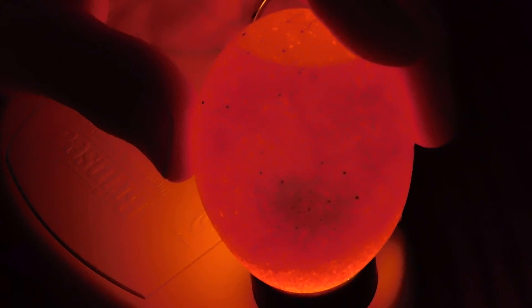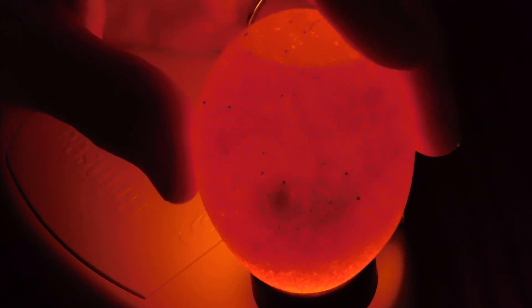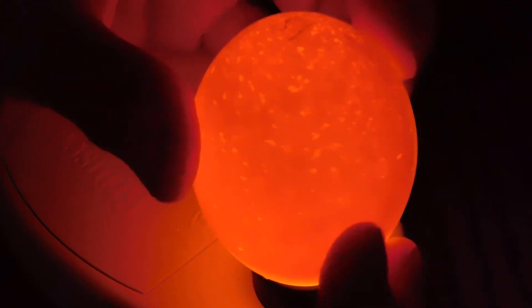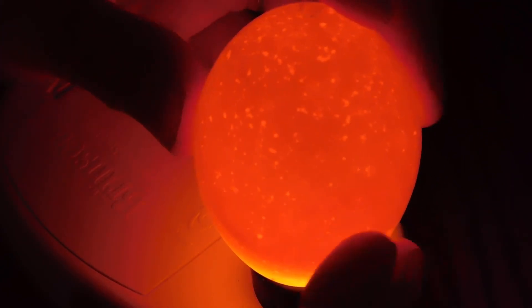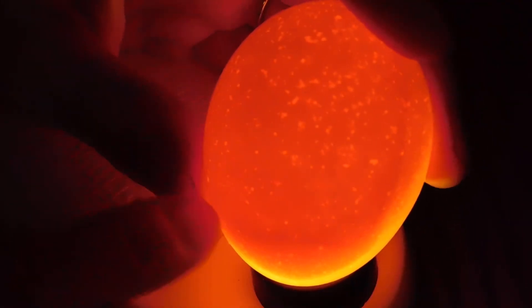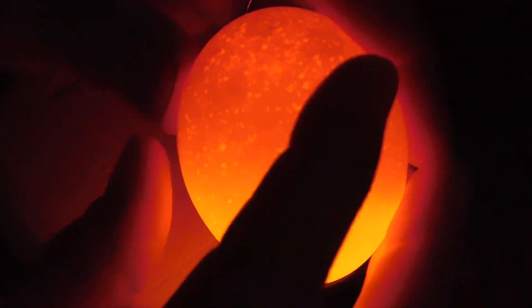Now we'll check out number seventeen. There you go - seventeen's alive and kicking, literally. Eighteen. Eighteen looks like it may have that fatal blood ring - just kind of see that outline of the vein, and I'm not seeing an embryo. But again, we'll leave it in there and check it next week.